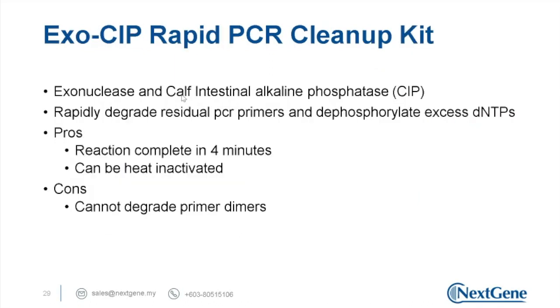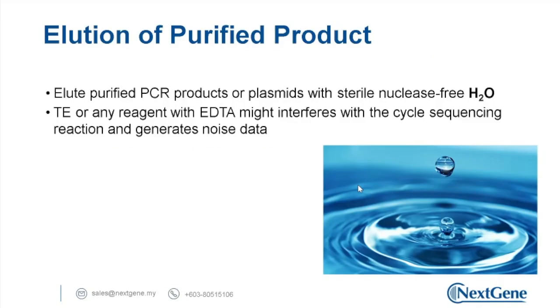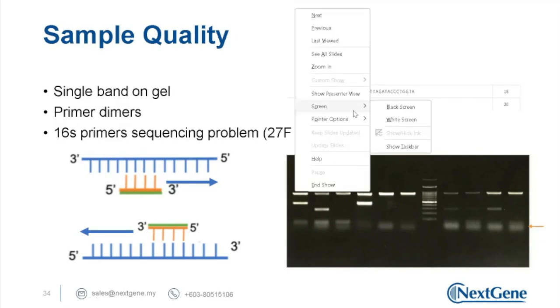Otherwise, we might need to pool the PCR product. We try to pool more reactions of PCR product, and then hopefully the well is big enough to fit more than one reaction. Or in certain cases, we might consider having side by side lanes.